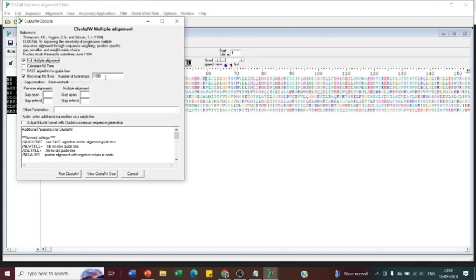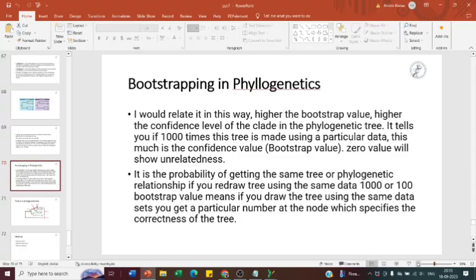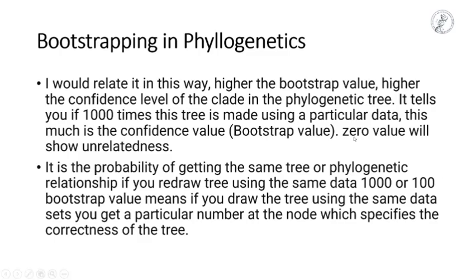they are asking for the neighbor joining tree bootstrap. They are constructing a tree, and then only they are finding out the multiple sequence alignment, as we have seen. So bootstrapping needs to be done. How many bootstrap replicates need to be done during the construction, we need to give. Then we need to study what bootstrapping is.